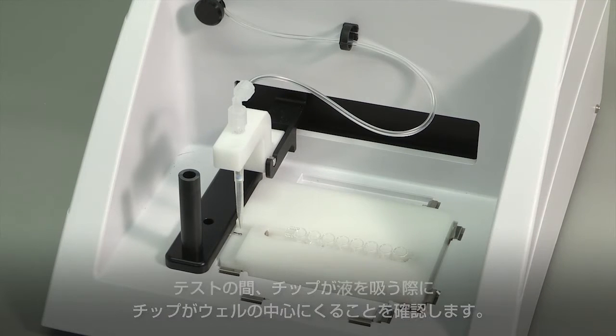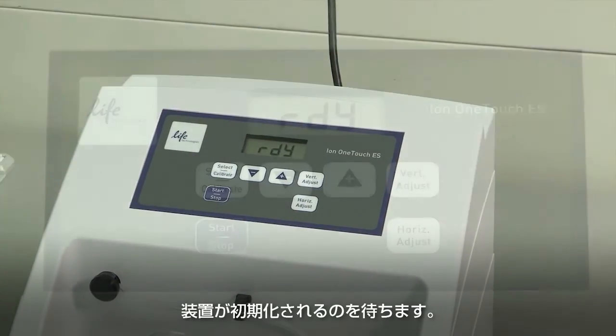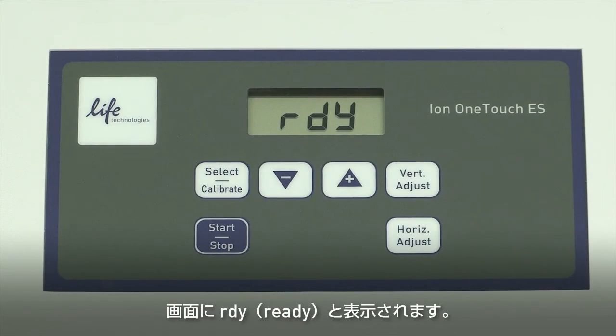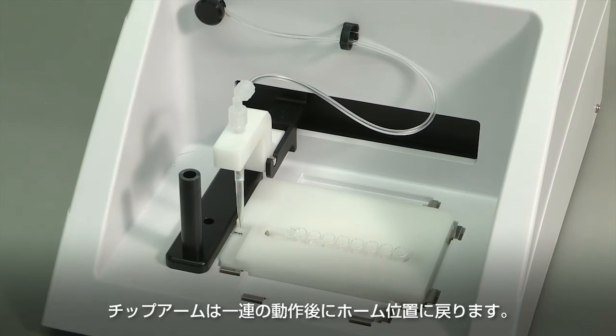Run the residual volume test. During the test, confirm that the tip is centered with respect to the sides of the wells when moving in or out of a well. Turn the instrument on and wait for the instrument to initialize. The screen displays Ready. The tip arm performs a series of movements and returns to the home position.